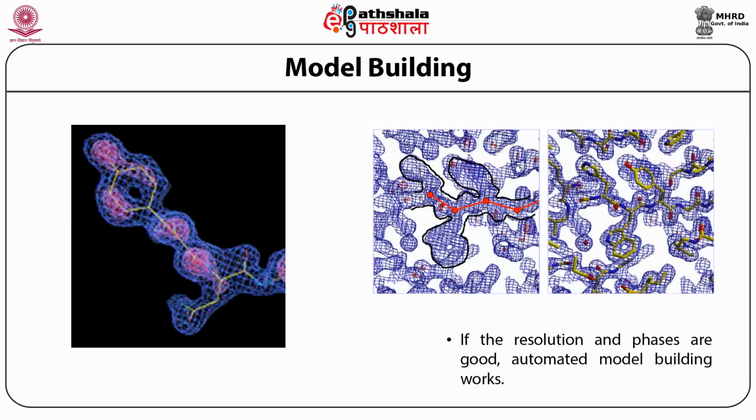So on the right side, as it is shown, it generally positions the C alpha positions and looks for at least 4 amino acids of electron density that should match with the sequence, and from there it extends in both directions, and that's how you do the model building.